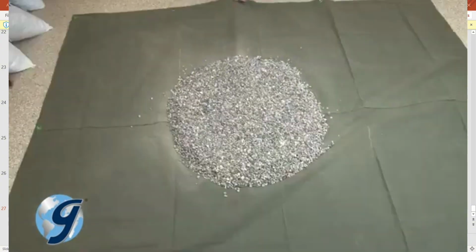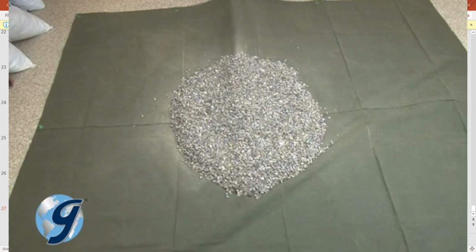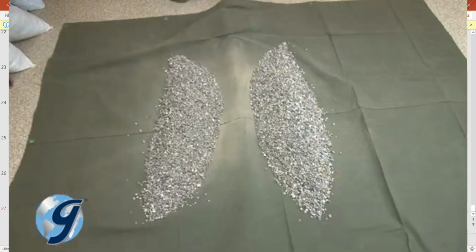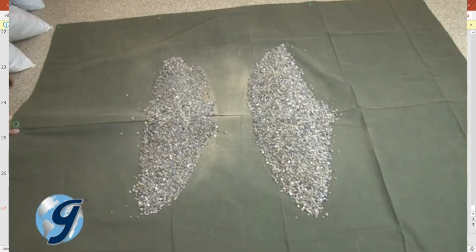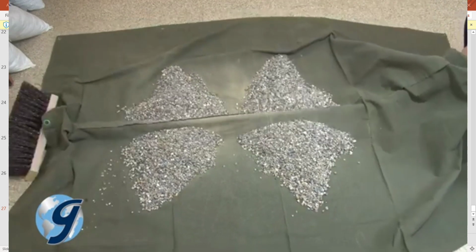An alternative quartering method is by inserting a straight stick under the canvas, dividing the sample into 2 equal halves. Then slide the stick under the canvas at a right angle to the first division, lifting the stick until the sample is divided into equal quarters.